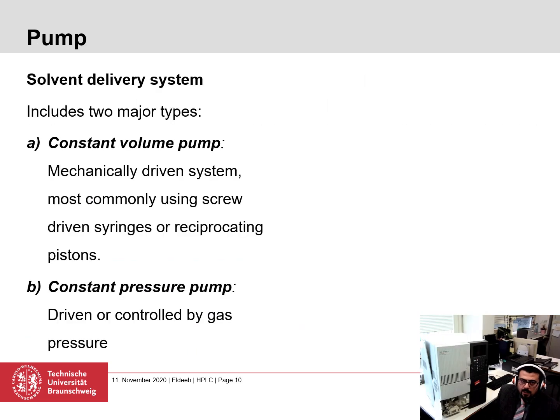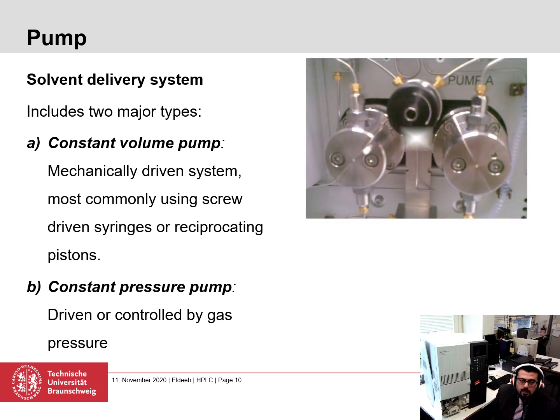And now about the pump, the solvent delivery system, the component which is shown here below in the system. We usually use a constant volume pump, which is a mechanically driven system to deliver constant volume.